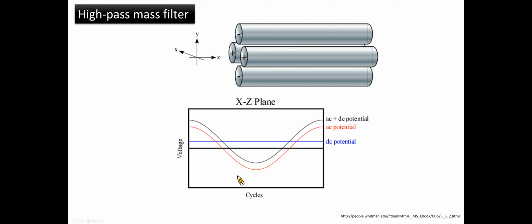Likewise, when the potential was negative, ions would accelerate towards the rods in response to an attractive force. During the negative AC potential, an ion comes into contact with the rods. It is neutralized and is removed by the vacuum. The factors that influence whether or not the particle strikes the rods during the negative cycle include the magnitude of the potential, the duration of time the ions are accelerated towards the rods, the mass of the particular ions, the charge of the ion, and its position within the quadrupole.